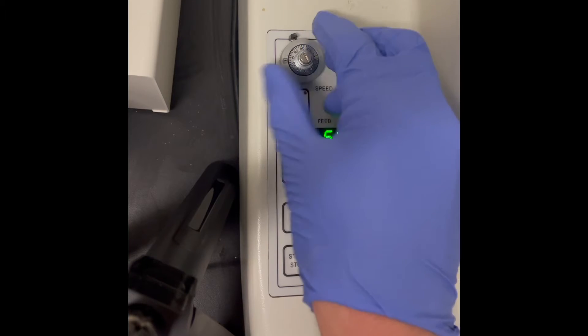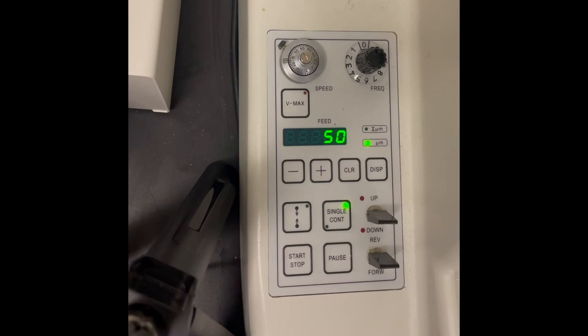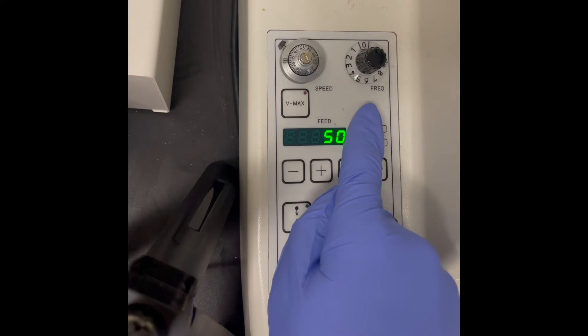It's okay to start at a faster speed, but if you notice small tears or ripples in the tissue as you're sectioning, turn that speed down.